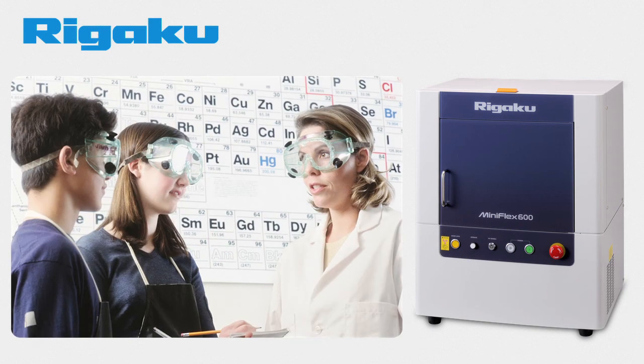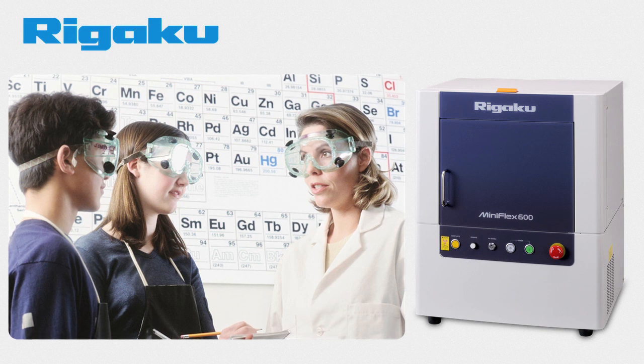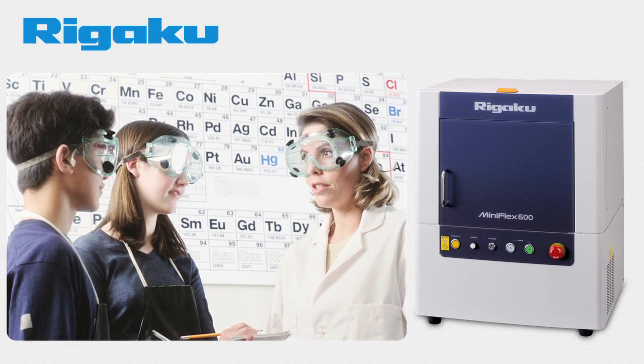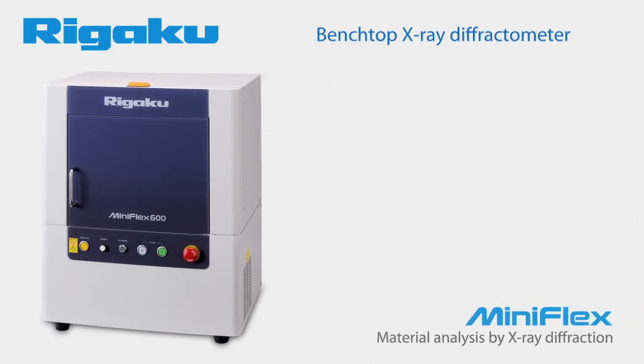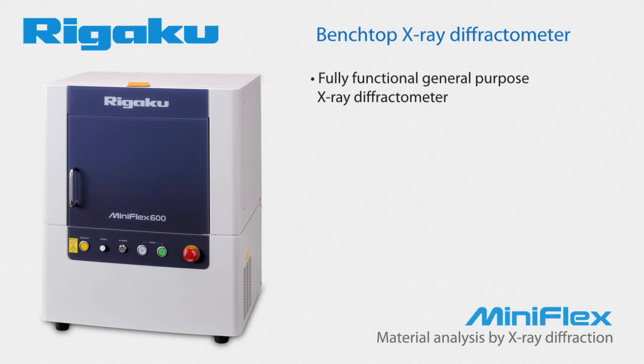It is also an important scientific technique taught to students who study Geology, Material Science, Chemistry, and Crystallography. Rigaku's new MiniFlex is a fifth-generation, fully functional, general-purpose benchtop diffractometer.